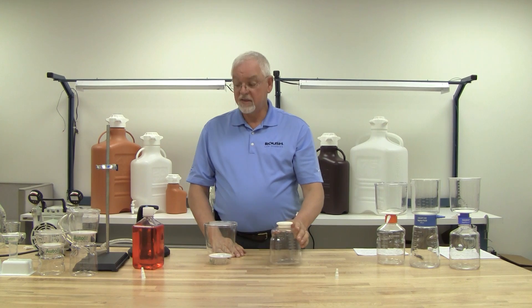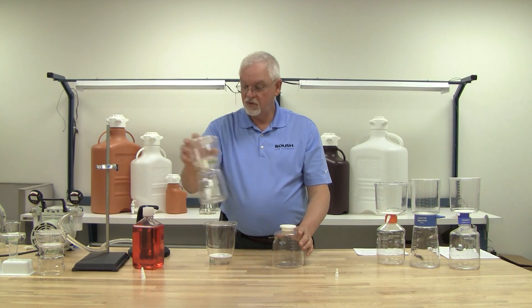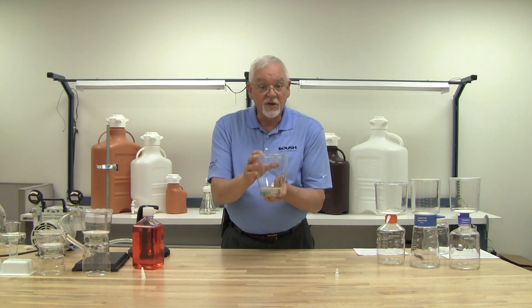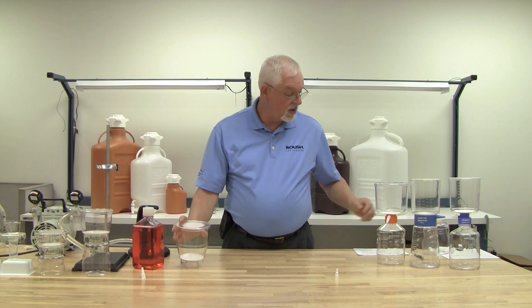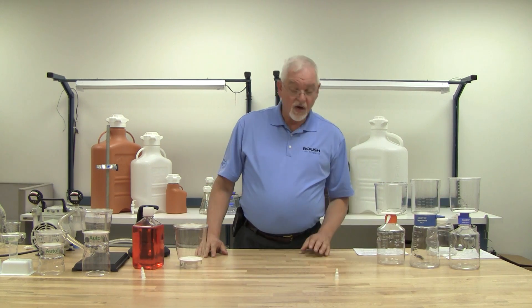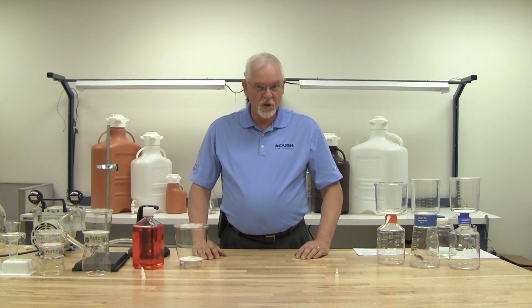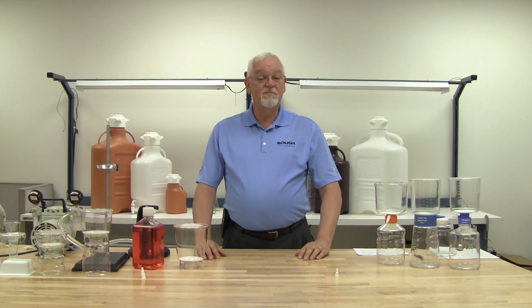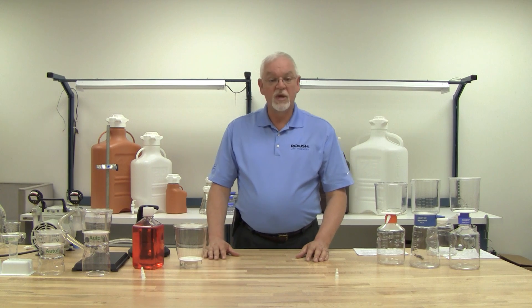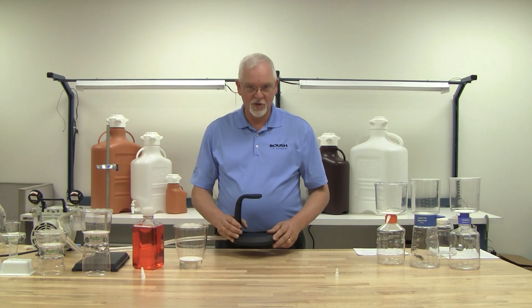The product can be purchased as a complete product, or it can be purchased with the funnel only. In addition, additional bottles can be purchased. For applications where there are large volumes of benchtop filters used, or where it is very important that the filtered material not spill under the hood, we have created our technology of the pedestal and the cradle ring.